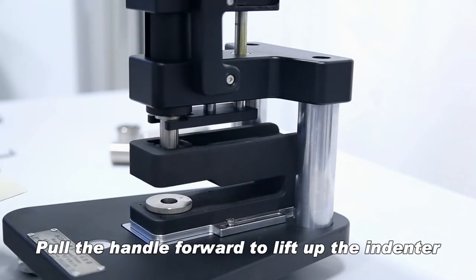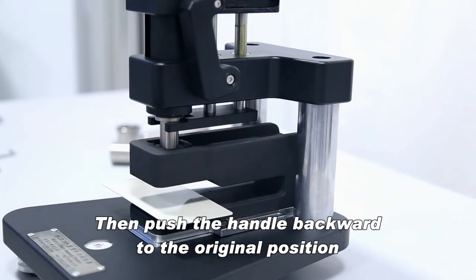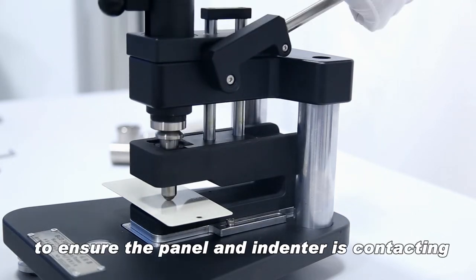Pull the handle forward to lift up the indenter and put the panel on the panel support. Then push the handle backward to the original position to ensure the panel and indenter are contacting.